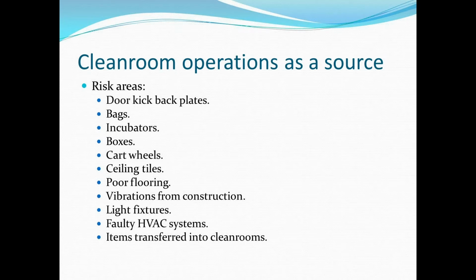bags, incubators, boxes, particularly depending on the material, and another reason in addition to bacterial spores why cardboard should never end up in a clean room. Trolley wheels are a notorious source, partly because invariably people forget to disinfect trolley wheels when moving trolleys between different areas. Loose ceiling tiles, damaged flooring.